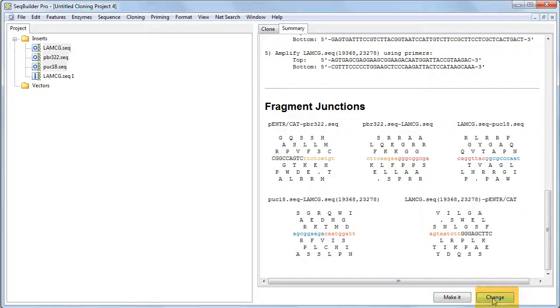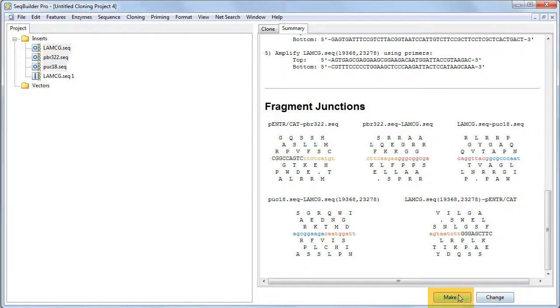Click the Change button to return to the Clone tab to make changes, or if you're satisfied with the current project setup, click Make It to proceed with the cloning simulation.